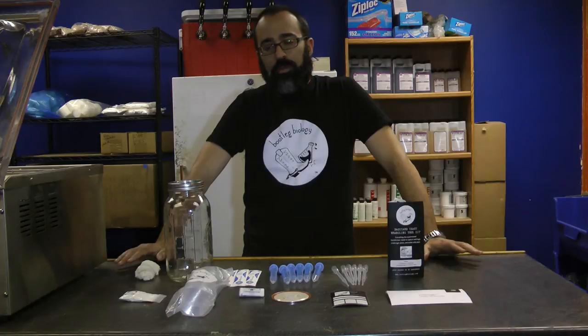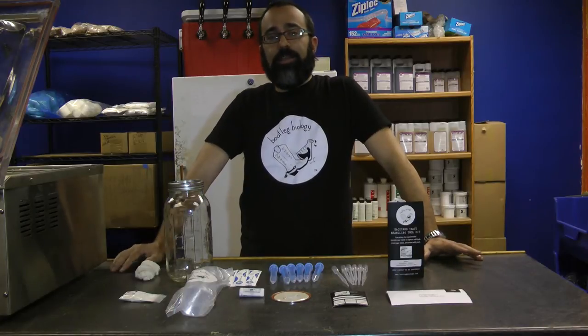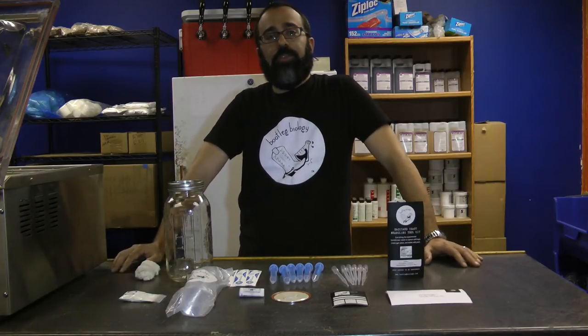So we've created the Backyard Yeast Wrangling Toolkit. This has everything you need to capture yeast, create agar plates, and isolate it to make that pure wild yeast terrain.